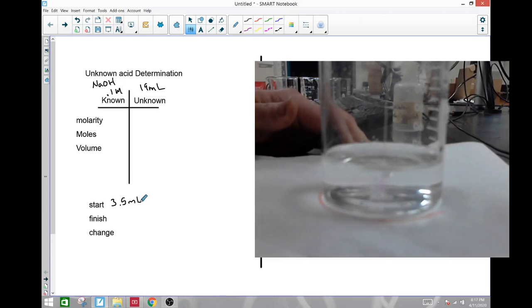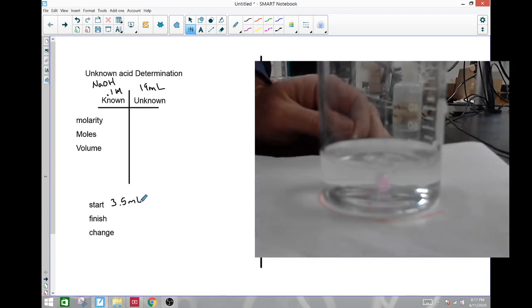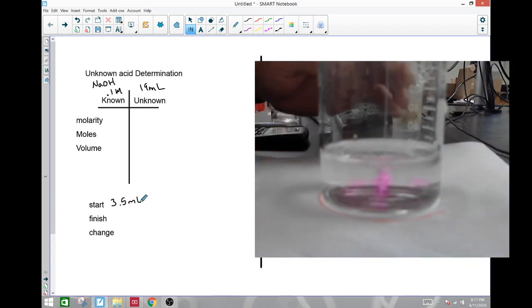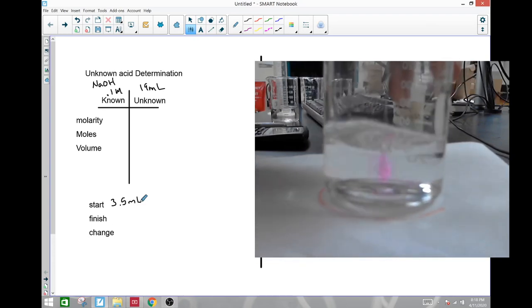We're now down to, I'll get about 15 milliliters in there, I think. Okay, let's let it go. Maybe don't worry about the volume till then. Just worry about this change in color here. And you'll see it's starting to change color, and I might want to do a little stir here just to kind of keep it moving.